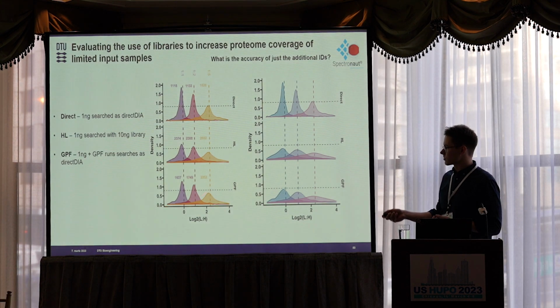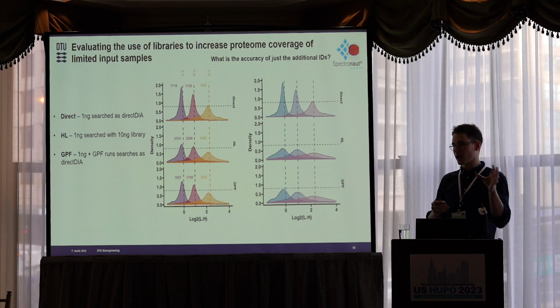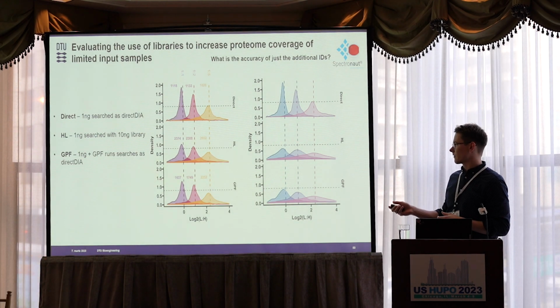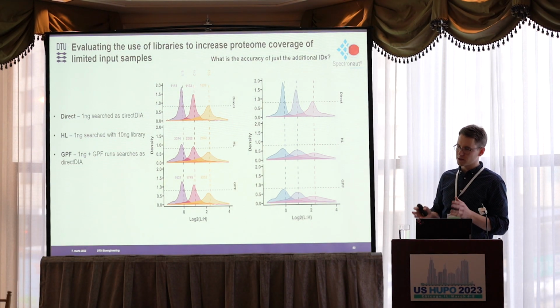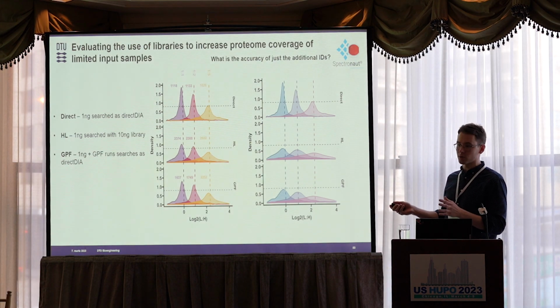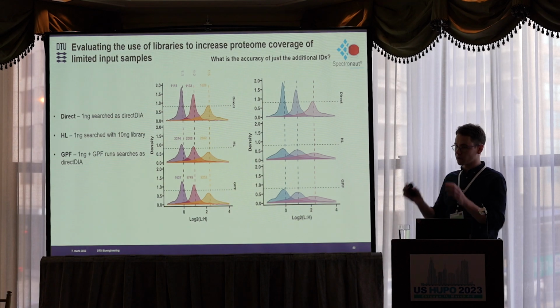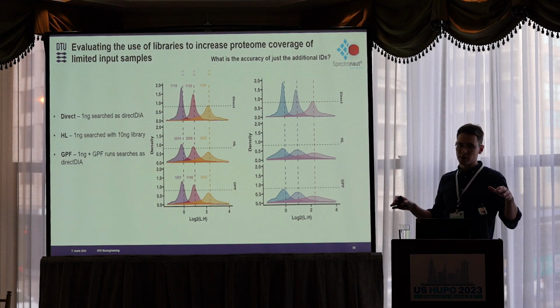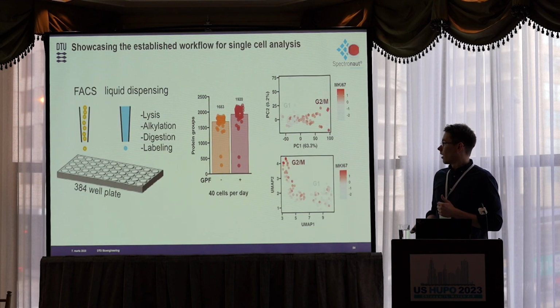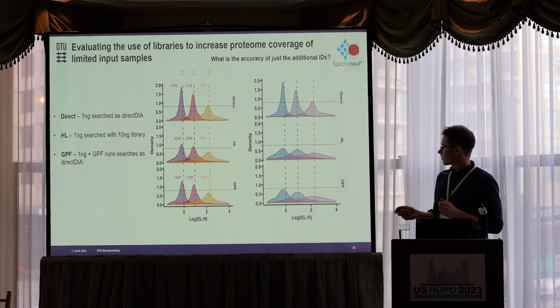And this is just the same distributions, but all the proteins that we can find by direct DIA without the library are subtracted. You can see that overall, the quality of this data is not very good and should be interpreted with some caution. It's not absolutely always wrong, but you can see that for some of the proteins the peaks are still in the middle. Overall, though, the distributions are really flat, showing that you have a high probability of getting the quant value wrong.